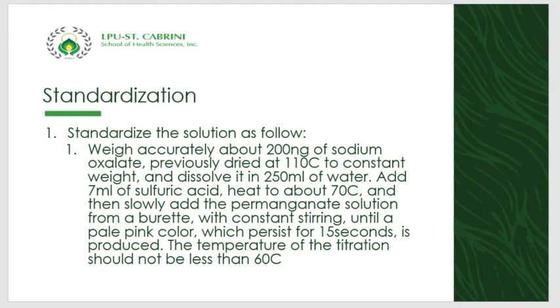Kaya yung ating mga, kasi may mga burette na ginagamit is rubber stopper. So sa atin hindi. Parang plastic yung gamit natin. Kasi nga, for example, dito nga yung mangyayari, okay? So magkakaroon ng effect dun sa ating experiment. So possible yun magkamali, since nga ganun yung nangyayari.